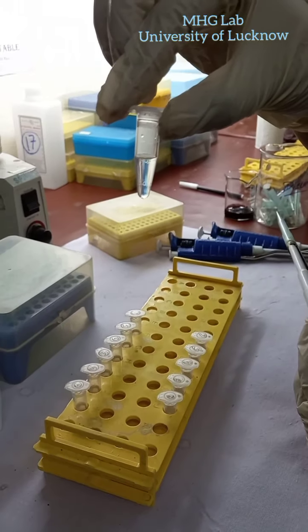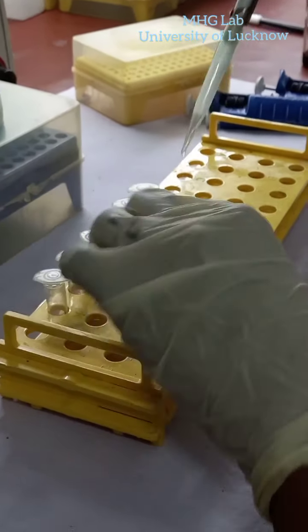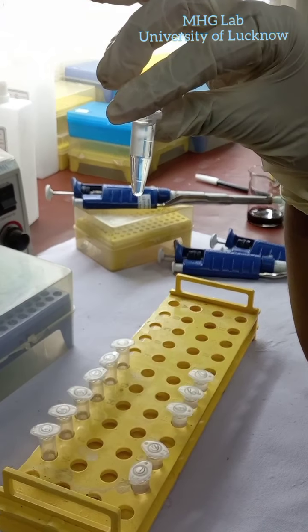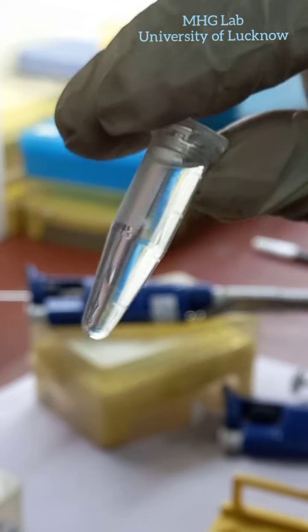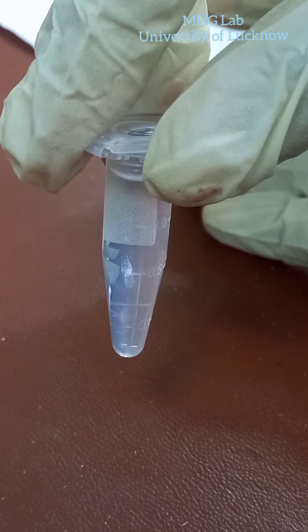Now to the separated supernatant we will add 1 ml of 100% alcohol to precipitate the DNA. We have added 100% alcohol to the supernatant and by mixing it like this, the DNA will be precipitated. Now you can see that this white thing present in the tube is the DNA thread.